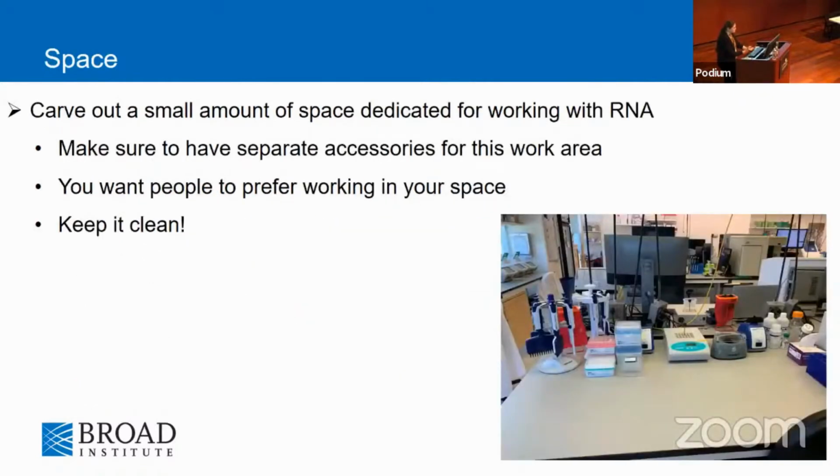And then space. You obviously want to carve out a little bit of space in your lab to do this because you're working with RNA. It needs to be very clean. So we have a little bench back in the corner that we do this. And people can reserve this in our online calendar system and then also get access to the 10x boxes.